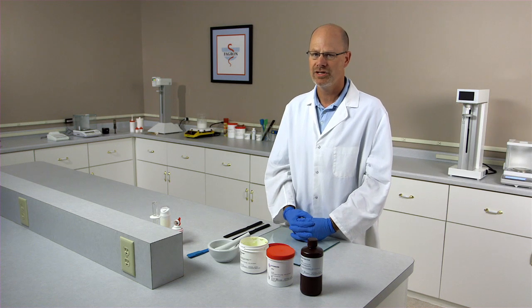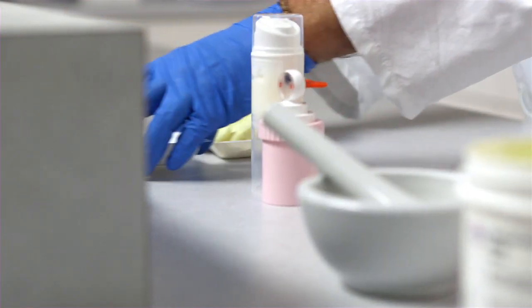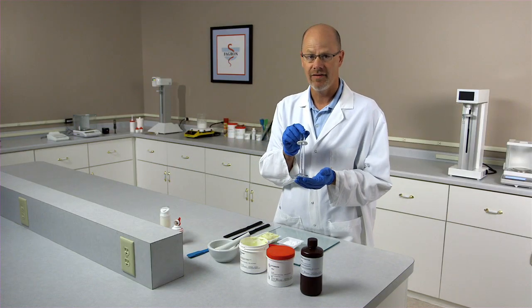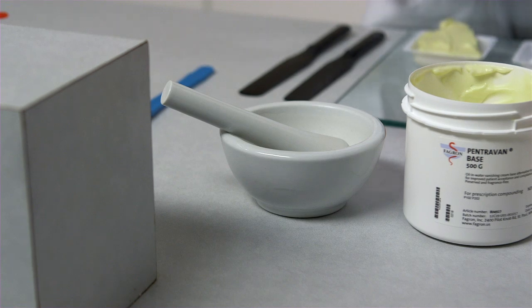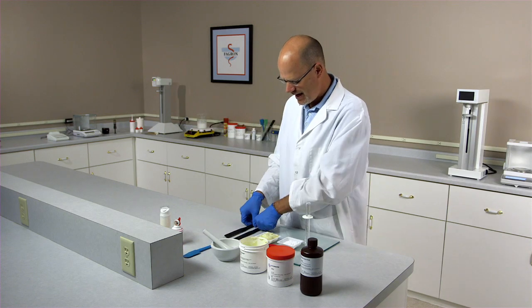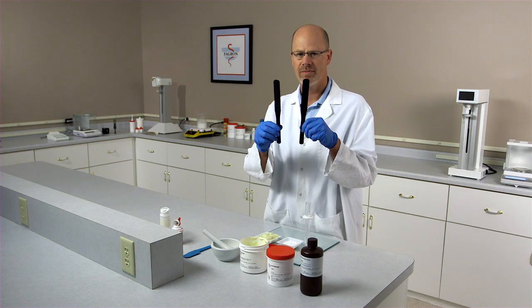The first thing you'll want to do is calculate the ingredients needed in your formulation. We've already pre-measured and pre-weighed the ingredients we'll need, and we have our ethoxidiglycol measured out. Items you will need for compounding are a ceramic mortar and pestle, a spatula, an ointment slab, and two hard rubber spatulas.